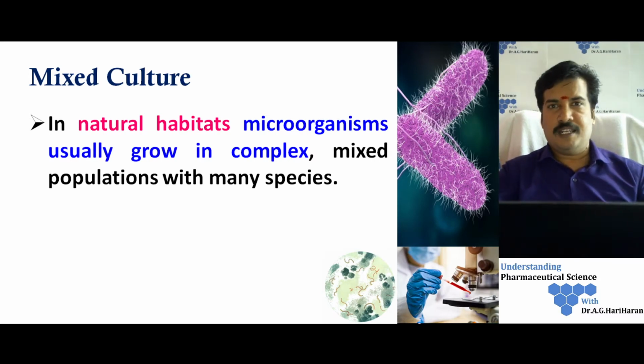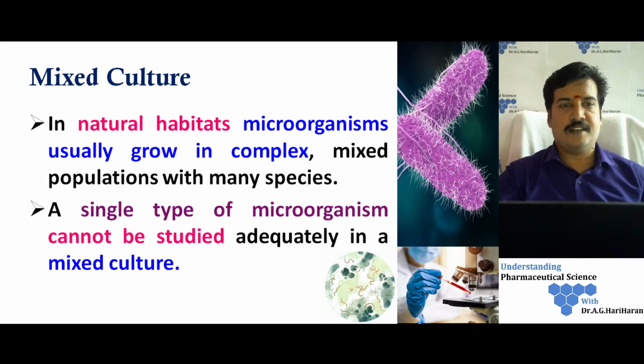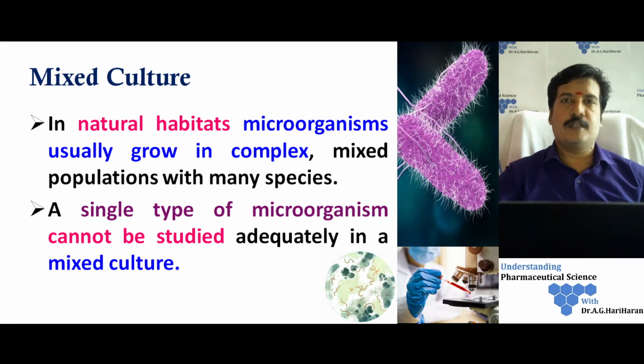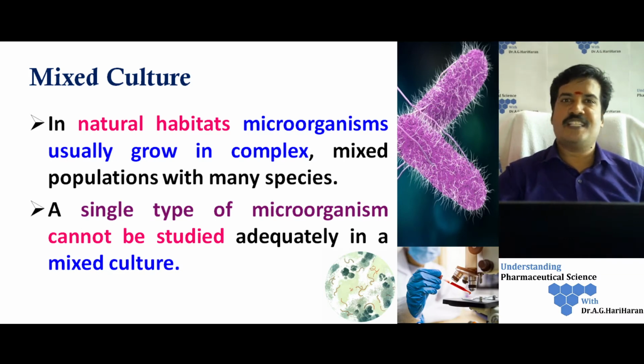Similarly, if you want to study a particular organism, it is very difficult to study it in a mixed culture. A single type of microorganism cannot be studied in a mixed culture. That's why we have to isolate the particular microorganism into a pure culture form. Then we can study that microorganism elaborately.